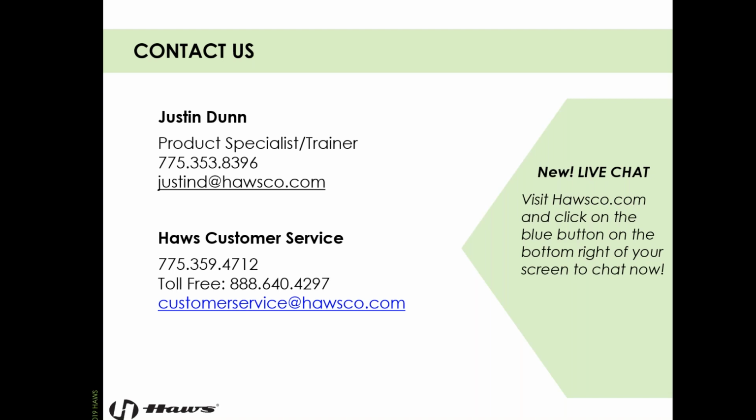There's lots of different mounting devices for these. And it has to lock on and stay on indefinitely for it to be compliant. So you have to be able to take your hands off of it and it run indefinitely for it to be compliant. And it can be a compliant eyewash or eye face wash, but the second you grab the device and you have to maneuver it or hold it open or take it off of the counter, it's non-compliant as an eyewash or eye face wash. It's just a drench hose at that point. So it depends on the situation, but very frequently drench hoses double as each type of equipment, but they have to have the right mounting device.